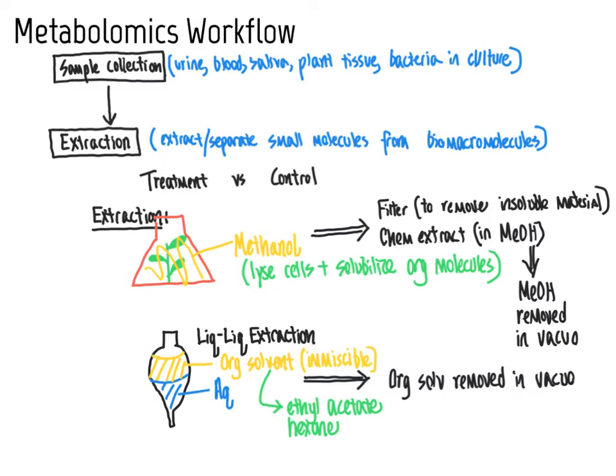In each of these extraction techniques, it is important to point out that there are limitations. A limitation to any extraction technique is that there will be some inefficiency, some compounds that are not extracted particularly well into the organic solvent. And ultimately, if the compound is not extracted well into the organic solvent, it is not going to be available later on downstream for detection by LC-MS, NMR, or any of our other techniques. And so as a result, some compounds can be overlooked in metabolomics because of limitations in this workflow.